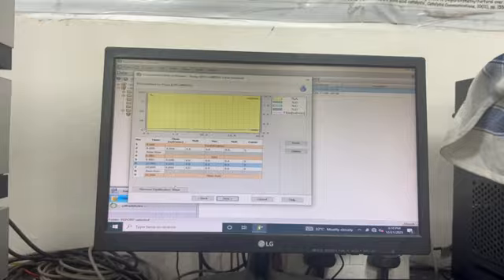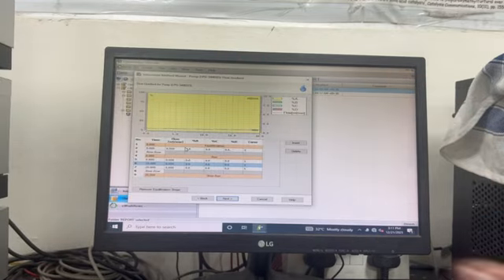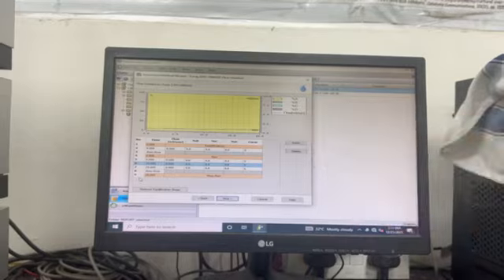Since we set the runtime to 20, that will be our stop run, so it's a poor example. It's just to give you the perspective of what the overall working process looks like. Generally we don't do that. You can see it in previous instrumentation methods, but you can do this if you want.